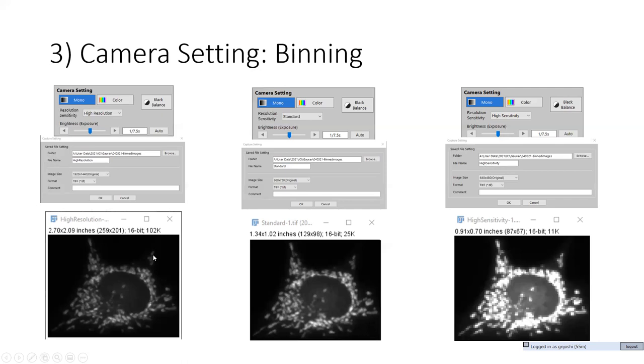So one question on that, can we change the image size here? It looks like there's the arrow button. Yes, so once we acquire the image at 1920 by 1440, we can change the image size to anything we want to. Once you acquire an image at 960 by 720, you can only save the images at sizes lower than this, but not any higher than this, okay?